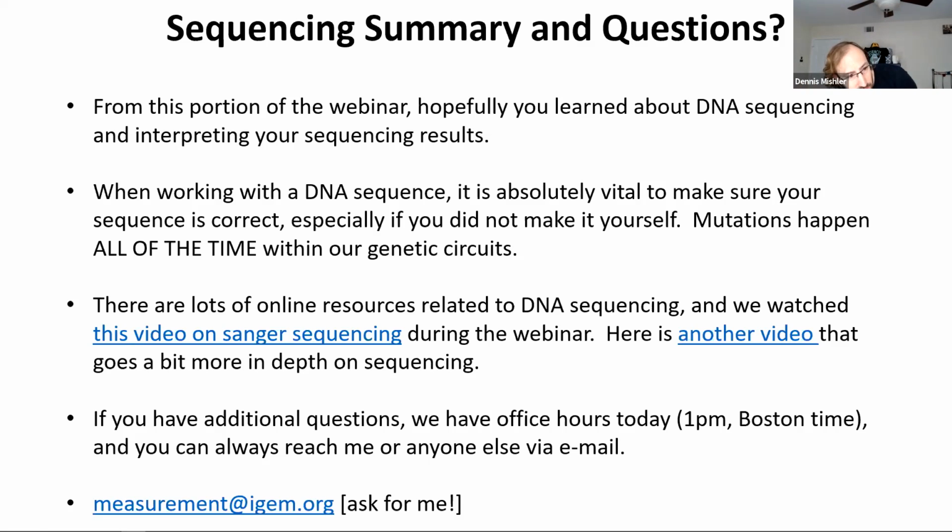Quick, rapid refreeze. So, I don't like freezing and thawing things. That's just always an issue. If you have to do it, it's not a big deal though, right? You can freeze and thaw something once, but if you have to do it repeatedly, you're more likely to cause mutations. That's true. So try not to, but it's not the end of the world. That's one reason why what I usually do, if I have a plasmid that I want to keep, I'll keep it frozen at -20. And if I want to use it for PCR and such, I'll make a separate tube that's my dilution tube or my working solution. And that one will get frozen and thawed repeatedly, and then I'll toss it. And then I can always go back to my frozen stock, which is kept always cold, and take a little bit out of that to make a new working tube that I work with. Okay. All right.